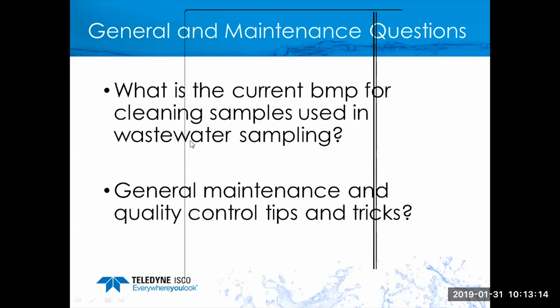The way I would look at that, a GLS sampler when the pump is running is somewhere in the neighborhood of about 3 amps, with maybe an initial surge spike of up to 6 to 7 amps. Whereas if we were utilizing one of our refrigerated transportable units, i.e. the Glacier or the Avalanche, that current could be double or even triple that. So we would probably want to go into like a 15 amp fuse, whereas a 10 amp fuse would be appropriate for most sampler models.